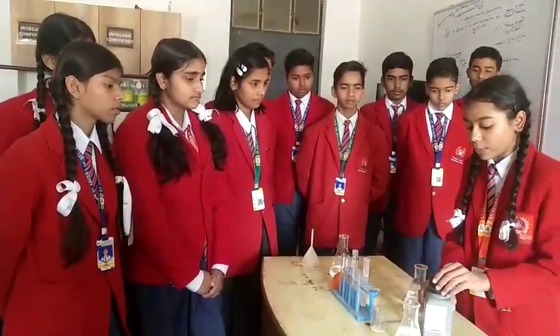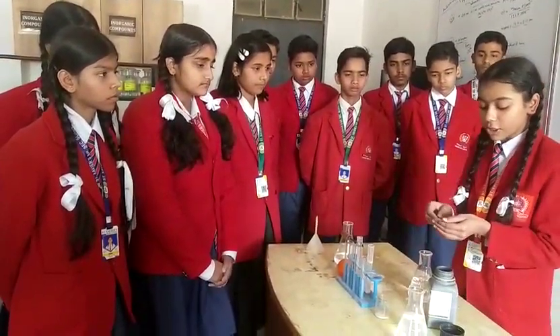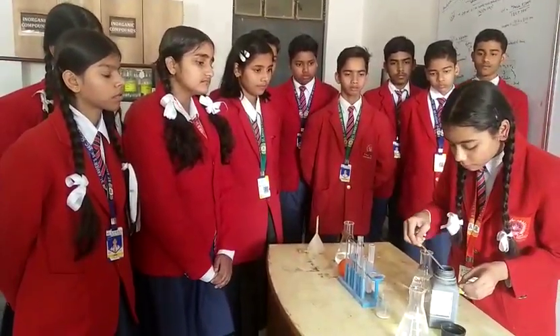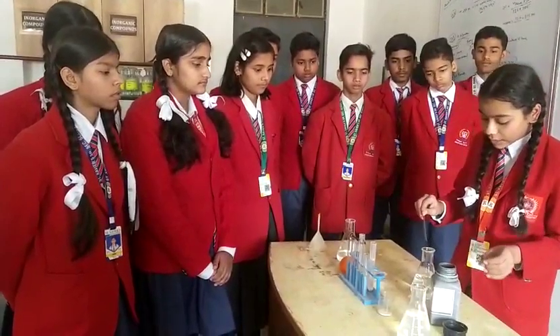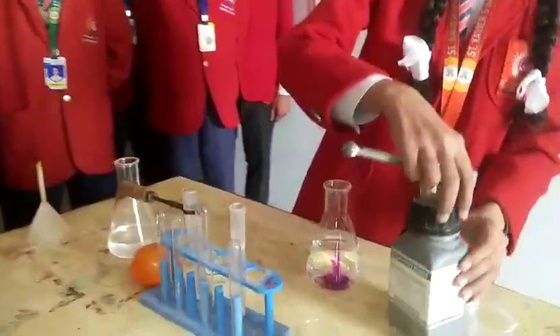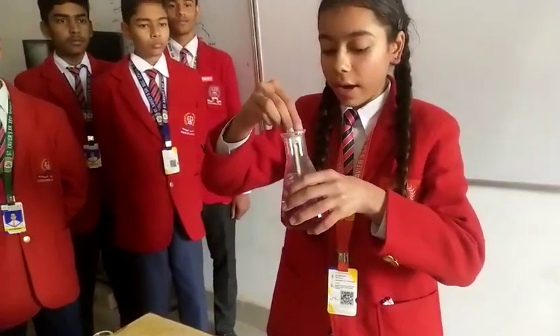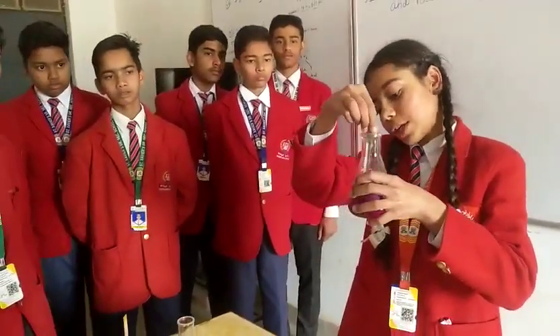So now we have to take some potassium permanganate with a spatula and we have to put it inside the water. As you can see, the potassium permanganate is now dissolving in the water and turning the water into a purple shade.